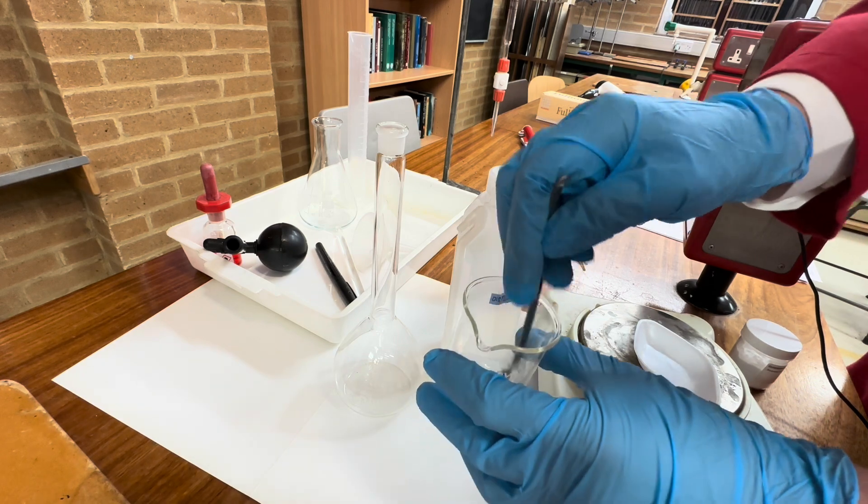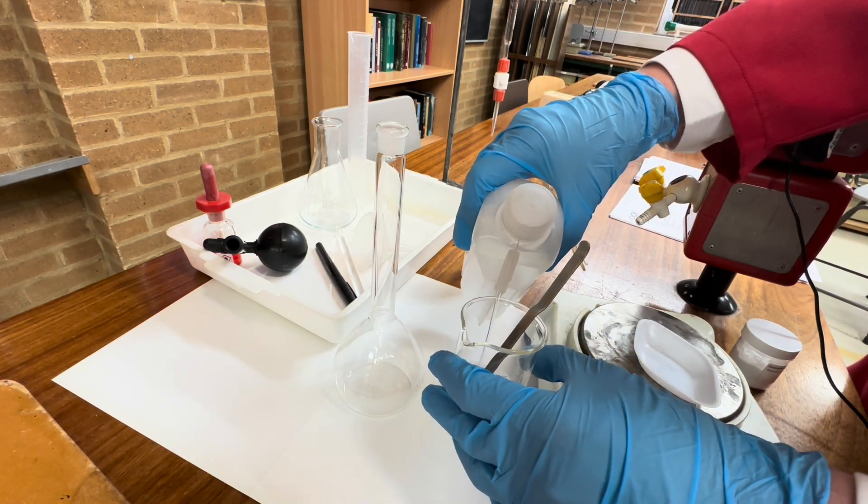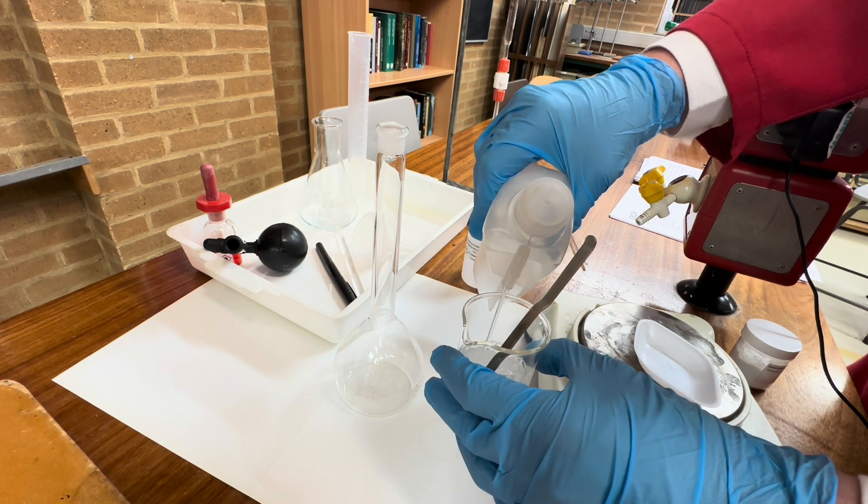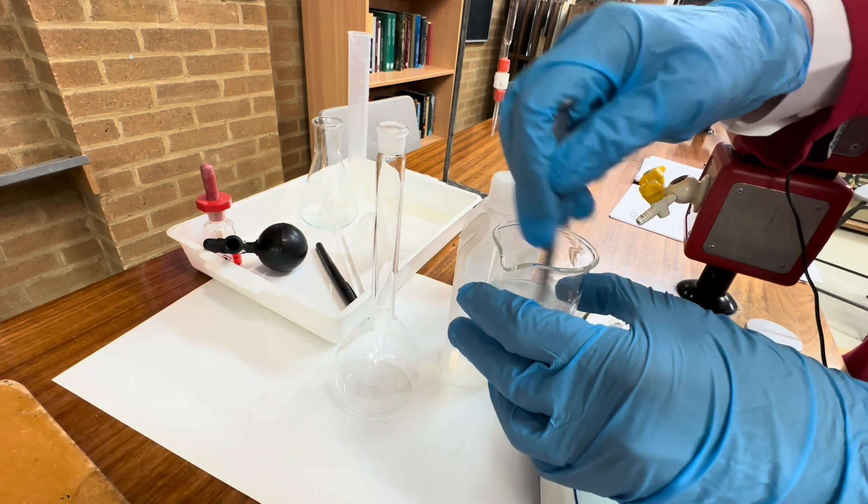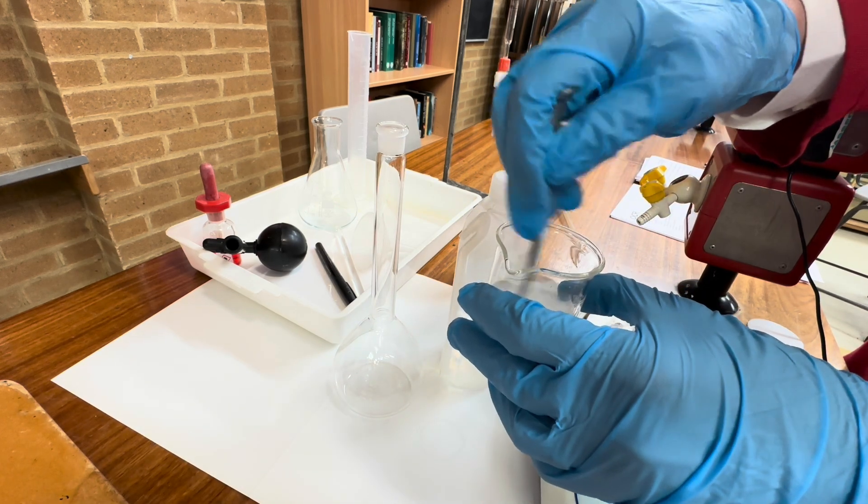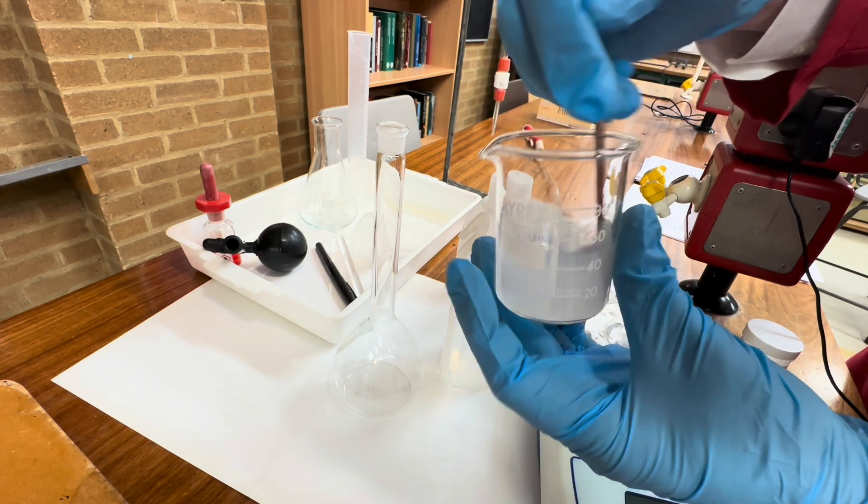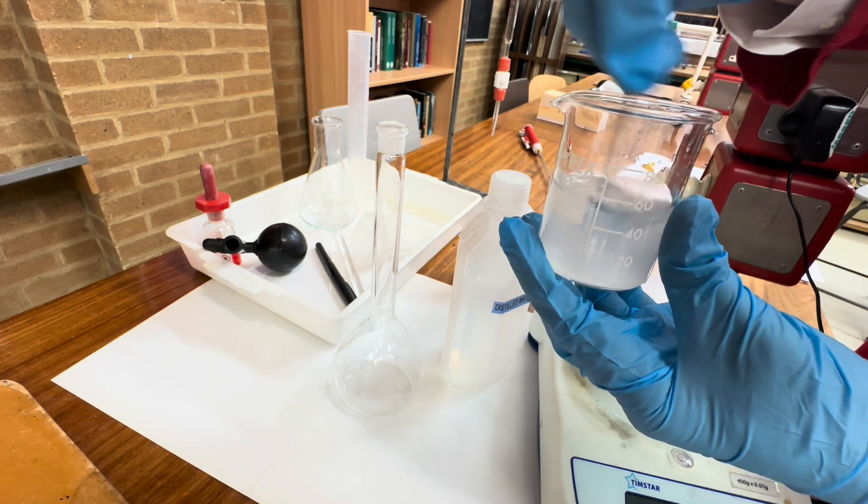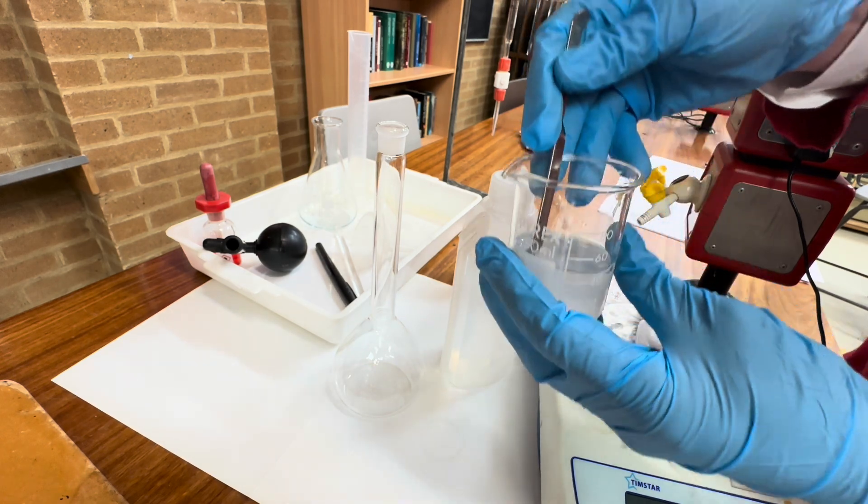Now an important detail is we need to ensure that this is all dissolved before we put it into the volumetric flask. We can add a fairly substantial amount of distilled water to this. As long as we don't go above 250 we'll be okay. Just give it a good stir, break up any large pieces that you can see. That looks dissolved.